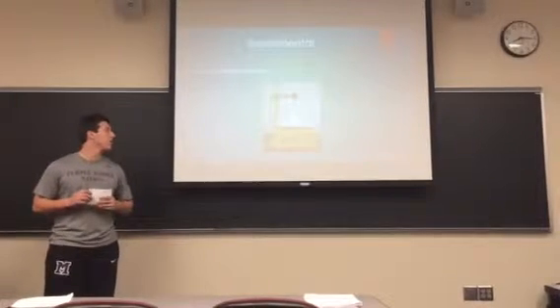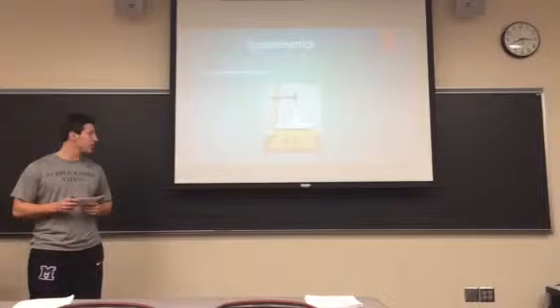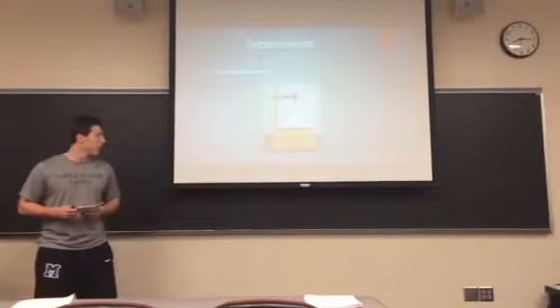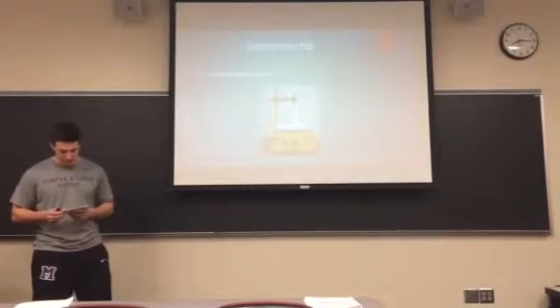First thing we did in the experiment was to set up the coffee cup calorimeter. This was done by taking 2 styrofoam coffee cups and placing them on the magnetic stir plate. A magnetic stir rod was put inside the coffee cups to help mix the solutions.